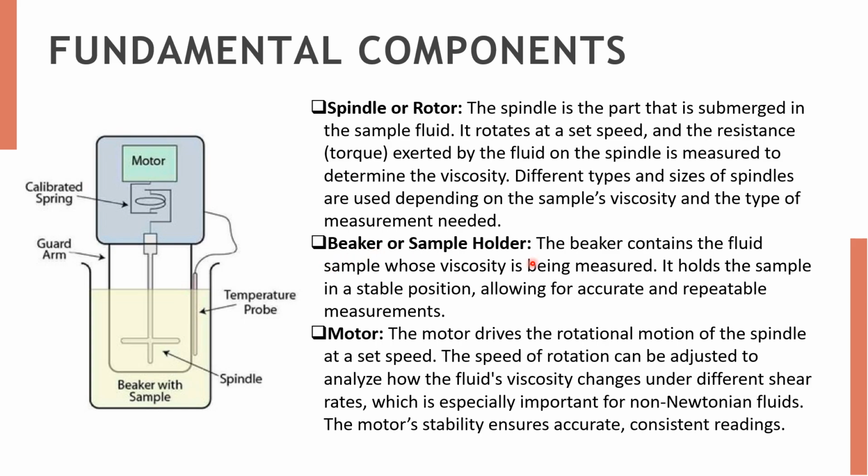The next component is the beaker or sample holder. Here the beaker contains the fluid sample whose viscosity is being measured. In the experiment, we have to make sure that the beaker which contains the sample is in a stable position so that we can get accurate and repeatable measurements. So our next component is the motor. This motor drives the rotational motion of the spindle at a set speed. The speed of rotation can be adjusted to analyze how the fluid's viscosity changes under different shear rates, which is especially important for non-Newtonian fluids. The motor stability ensures accurate and consistent readings.